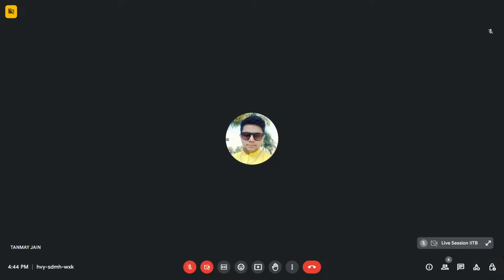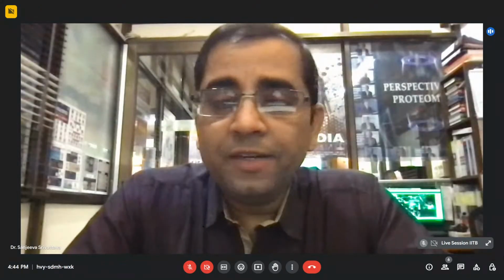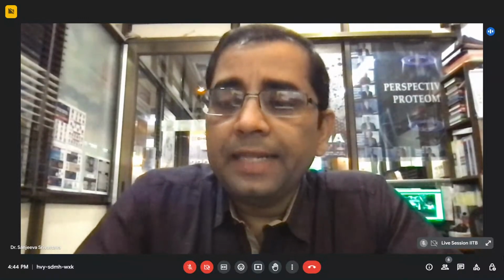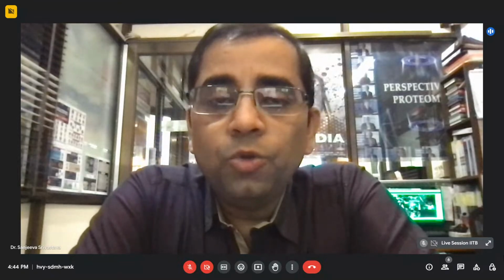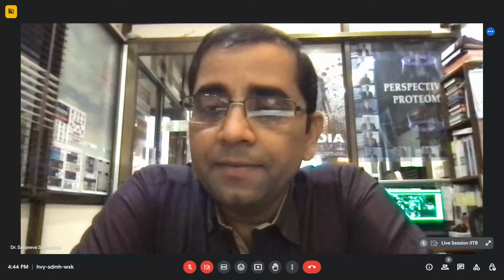Yeah, so Amrita, I think it's a good idea to also briefly talk about the peptide quantification, not to show the process, but that's very important in proteomics. So again, if you want to inject any sample into the mass spectrometer, you need to know the amount of protein and peptide available to be injected.